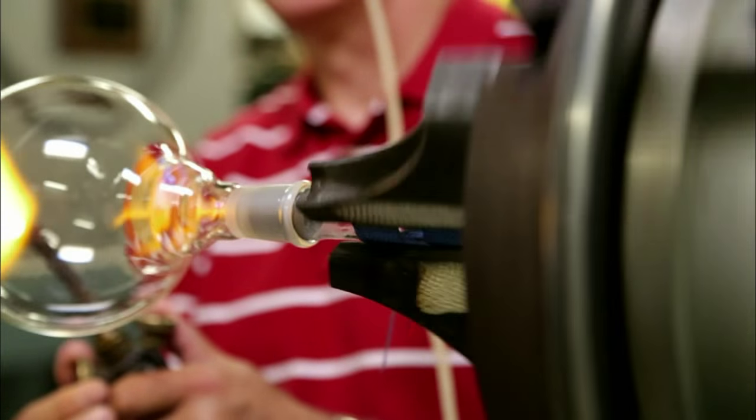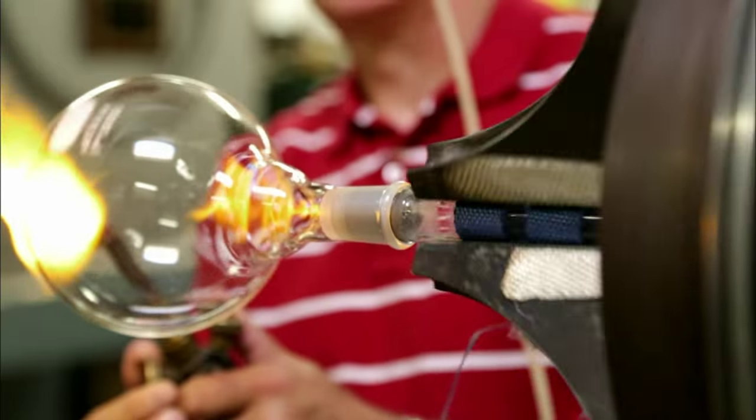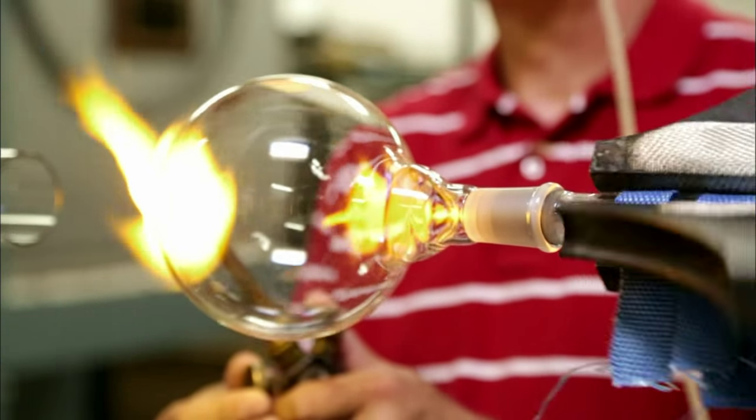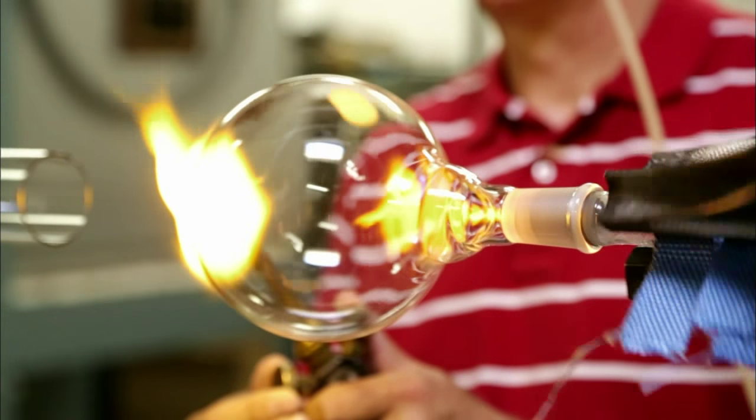So the lathe rotates the glass for us. The tail stock on the lathe moves so I can feed in glass or take glass away and then by blowing air into it I can expand the glass. Even though a machine is involved it's a handmade piece.